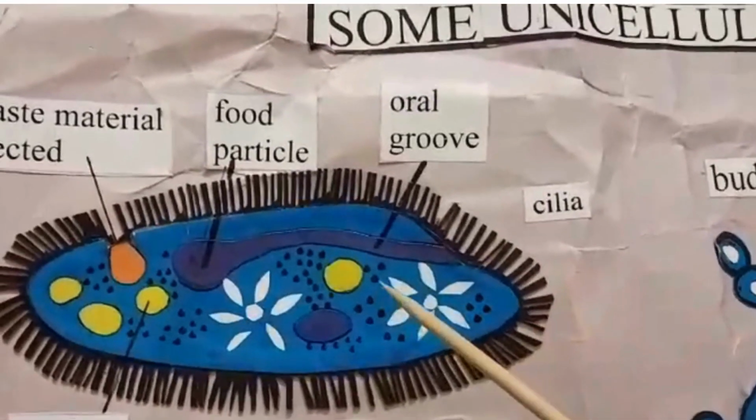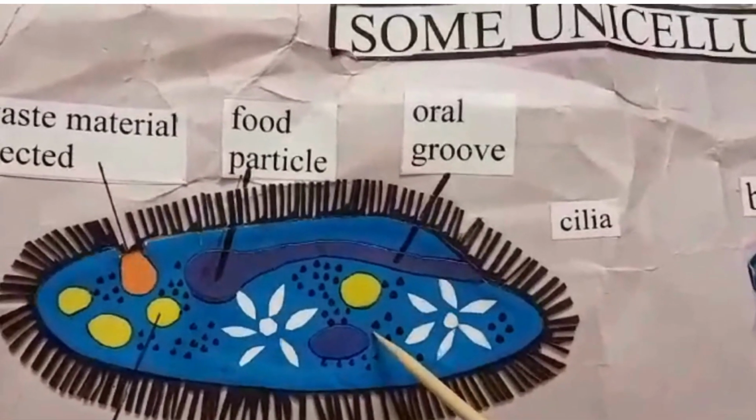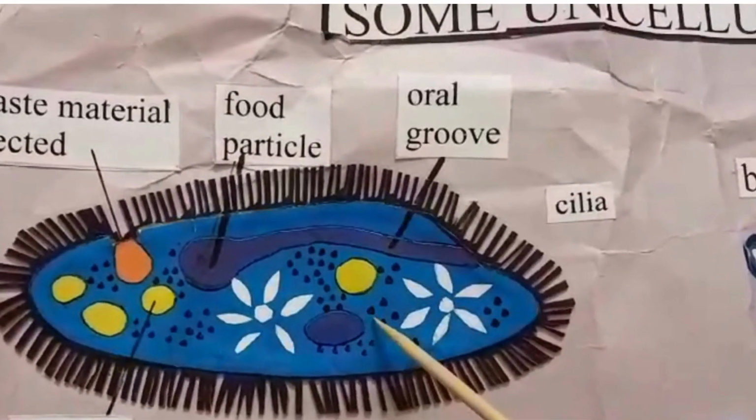Assalamu alaikum. In your biology practical-based assessment this time, you need to identify the microbes.